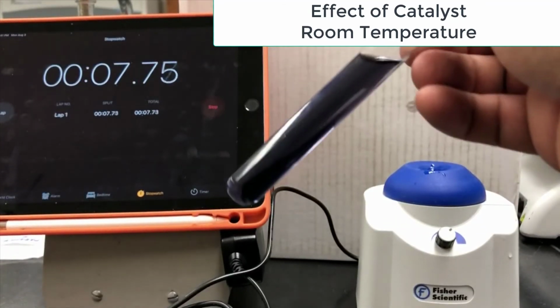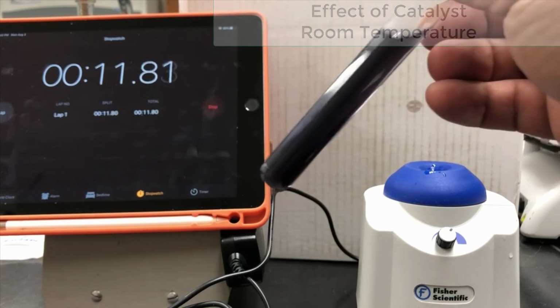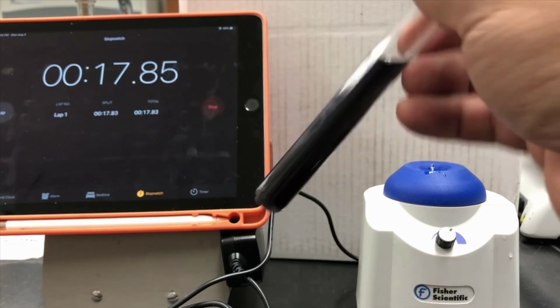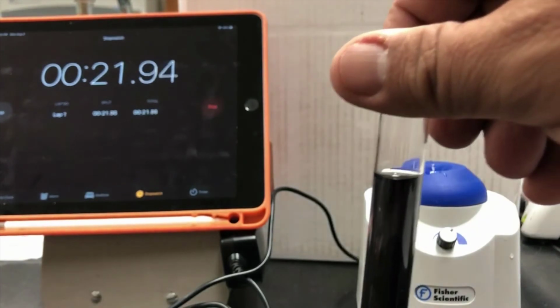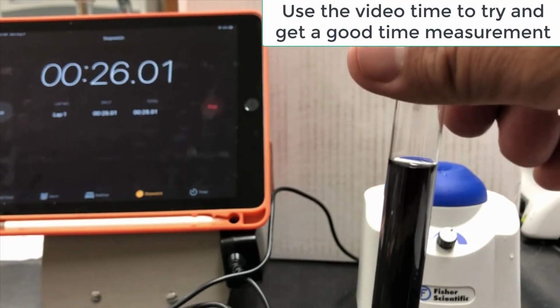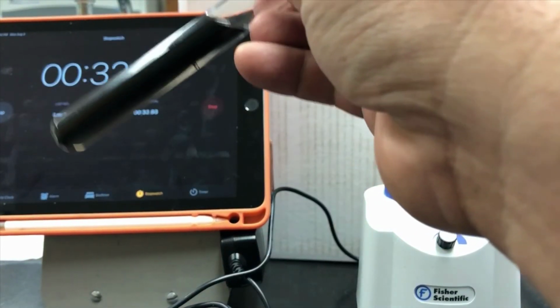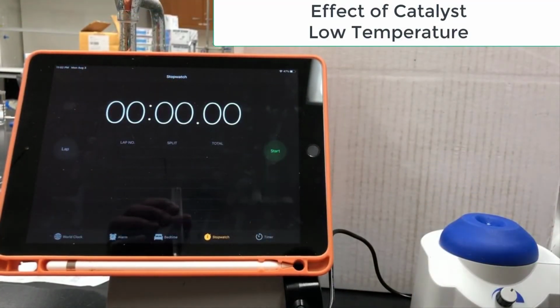Catalyst makes the reaction so fast, at least at room temperature, you can't tell that there's any delay between the reaction and when you mix the two solutions together. So go back and see if you can see a time, but I'm pretty sure you won't be able to have an accurate time. It'll basically be as soon as I poured them together. So anyways, take that as sort of an indicator of how effective a catalyst can be when it lowers the activation energy.